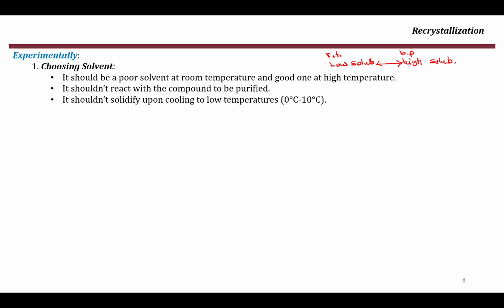So you have to make sure that your solvent has a freezing point really below minus 20 degrees, in order to avoid transforming the solvent into a solid, which would ruin the whole process. It should also have a low boiling point in order to be able to easily remove it from the crystals.